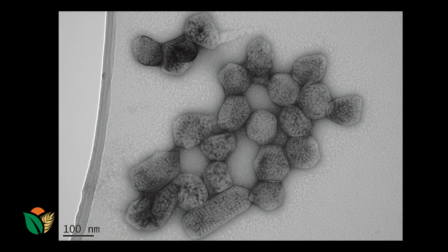And these carboxysomes also can be isolated and looked at under the transmission microscope, and here it is. And you can actually see the very special shapes of it. So this has been a big breakthrough, but more components are still needed for it to be functional. And we hope that eventually we can produce plants that have increased photosynthetic efficiency and higher food production.